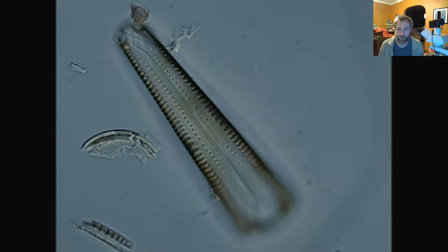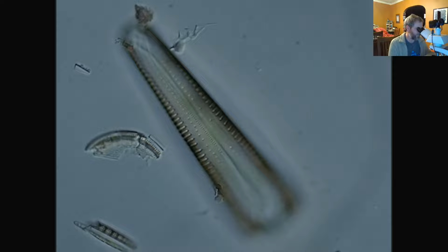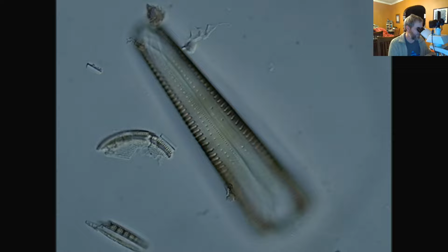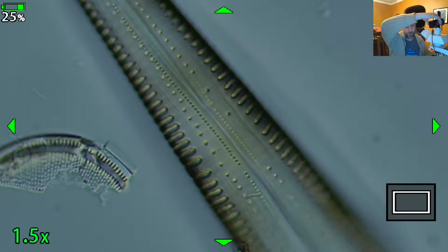So, what is this that I'm showing? This is a gomphonema. It's a type of diatom. It's in girdle view, and it's from a water hydro plant in Idaho that one of my friends sent me. And we can zoom in, look at it very closely if you'd like. So I can use my camera's zooming power. We can get really close up into it.